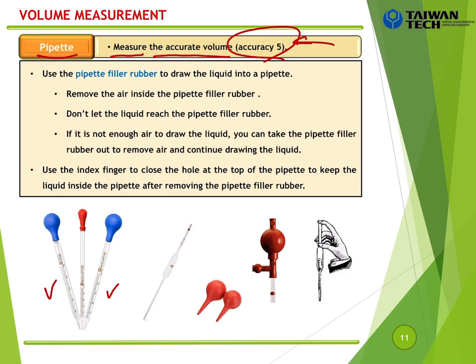If you come to the lab, you should know this is the pipette. Okay, so now you already know, right? So when you come to the lab and use the pipette, something you should know is that we may have two, actually maybe a little bit different, main types of pipette here.